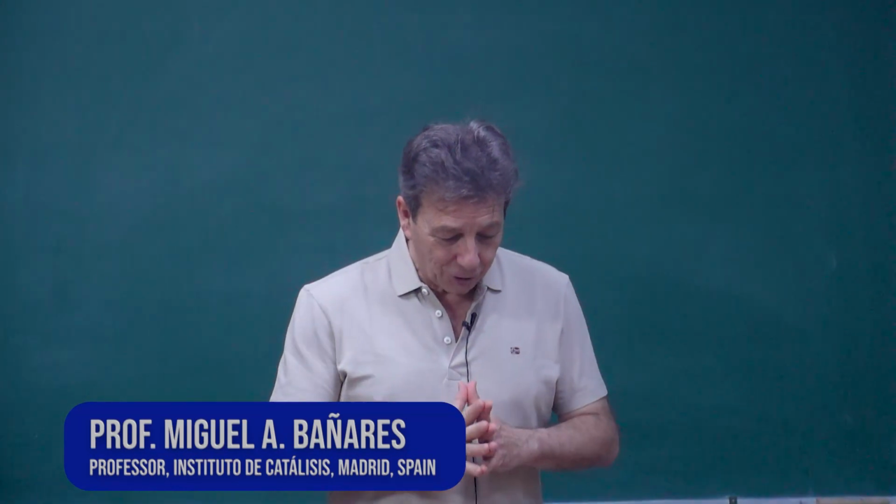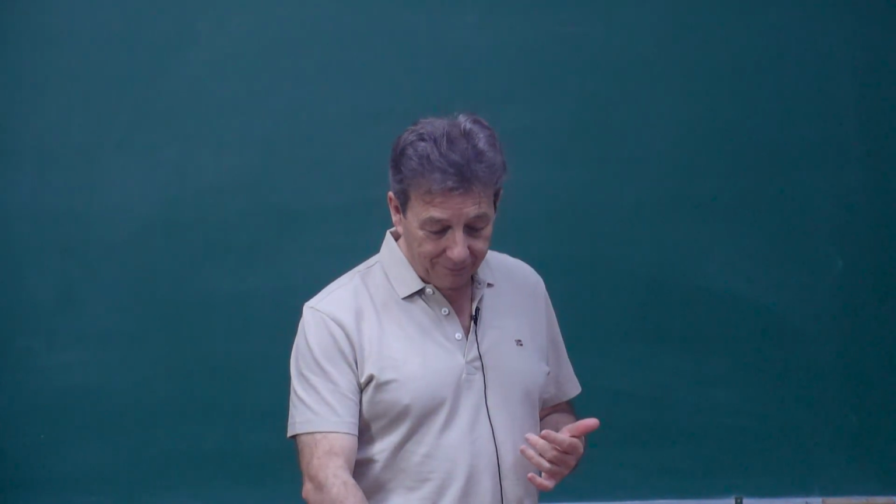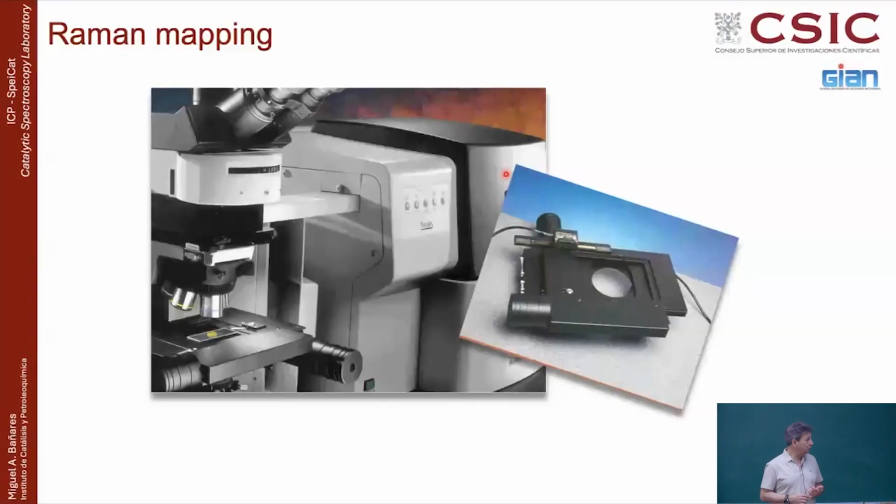Okay, fine. So yesterday we were talking about different things on Raman spectroscopy, and another thing that is also possible to do with Raman systems is to make maps. They typically come connected to a microscope, and this allows you, looking within the spatial resolution of optical microscopes, what is happening in your system. You can get chemical images. At the different coordinates, you can get different information.